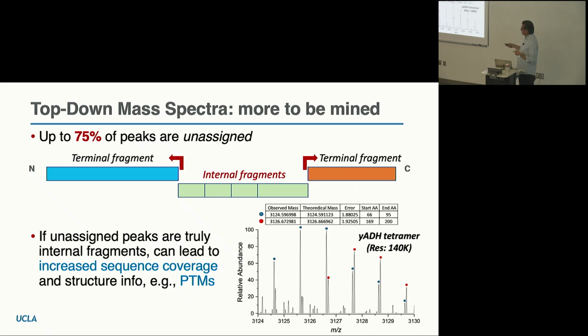It's especially problematic for electron-based fragmentation, where you get all kinds of different assignments because of +1, -1, protons flying around, radical sites going on. And UVPD is just another can of worms that I don't even want to touch. If we can figure out if these are real or not, and what kind of rules we need to rigorously assign these, then that would advance the field. But yes, it's not easy to do MS3 on these experiments.